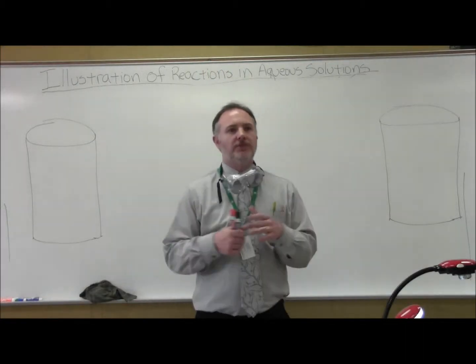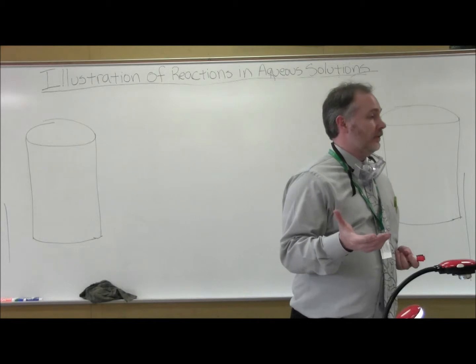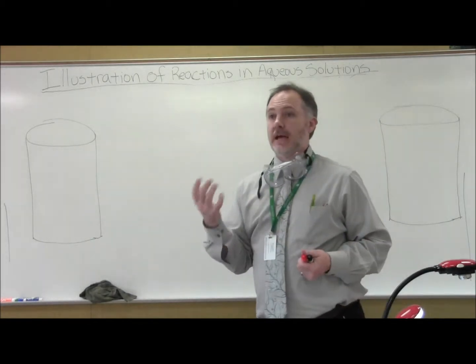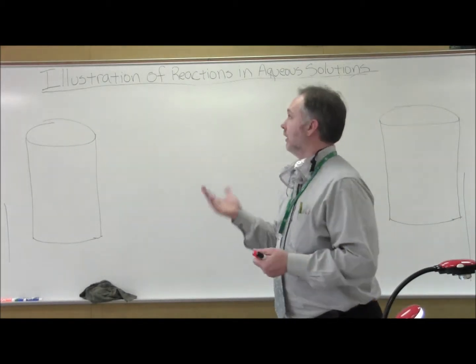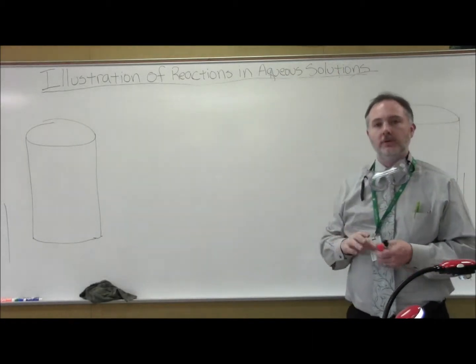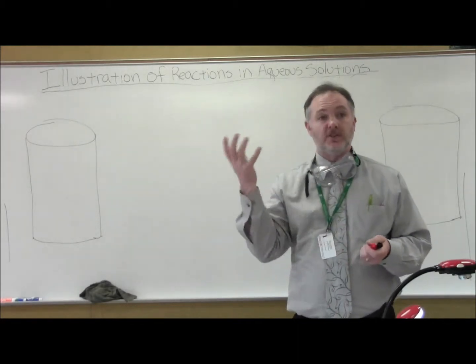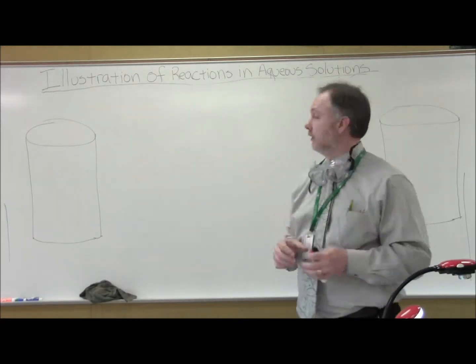I'm going to do a little demonstration and illustration activity with aqueous solutions, and the key point is the net ionic equations that you're learning. Please title it Illustration of Reactions in Aqueous Solutions. Our goal is to see what happens when we have this stuff dissolved in water. It's kind of hard to see sometimes.